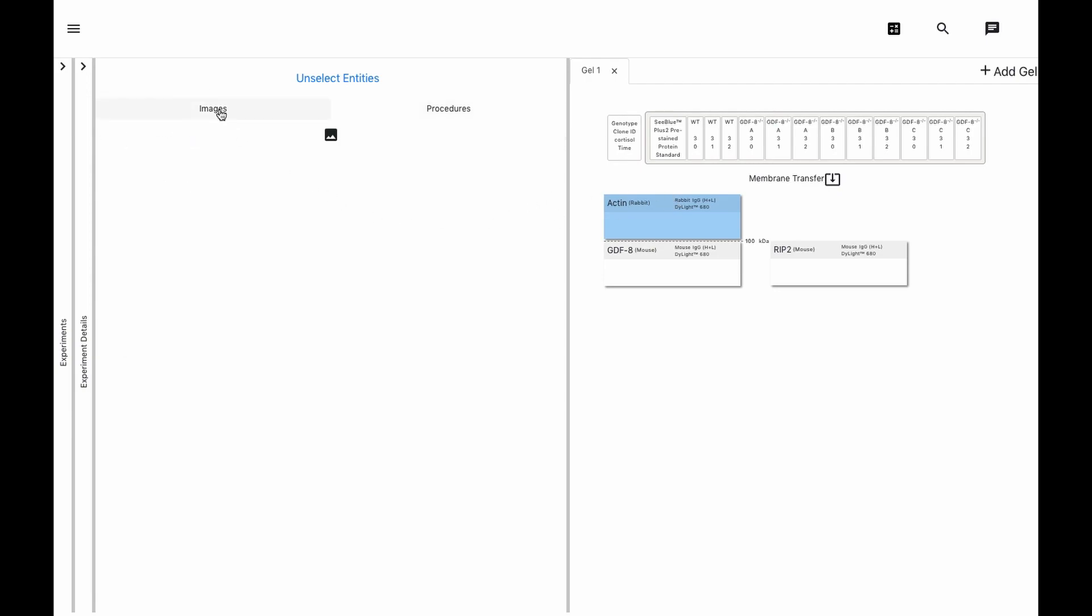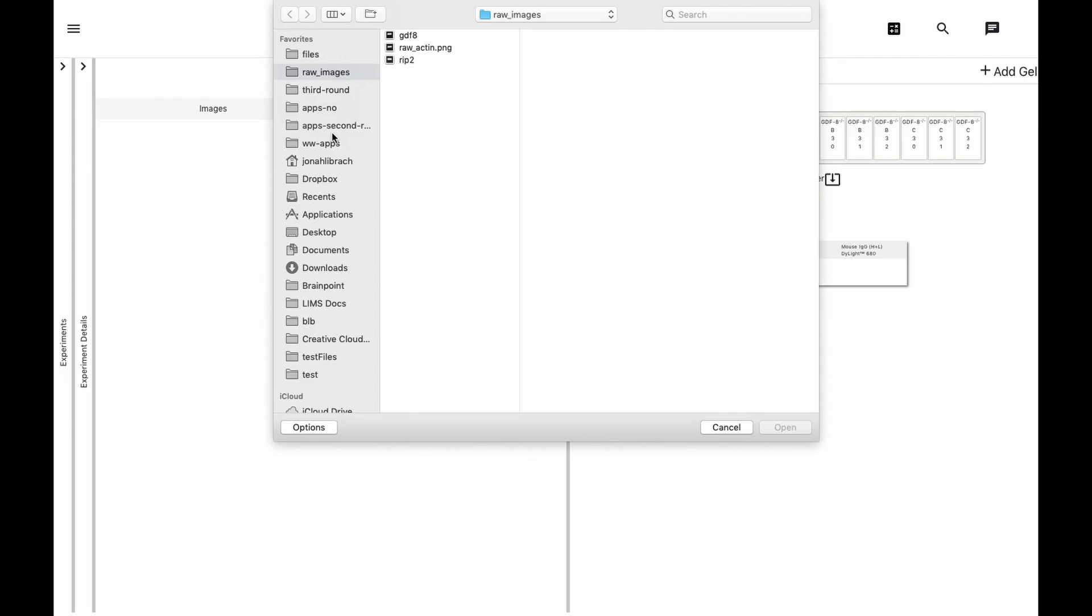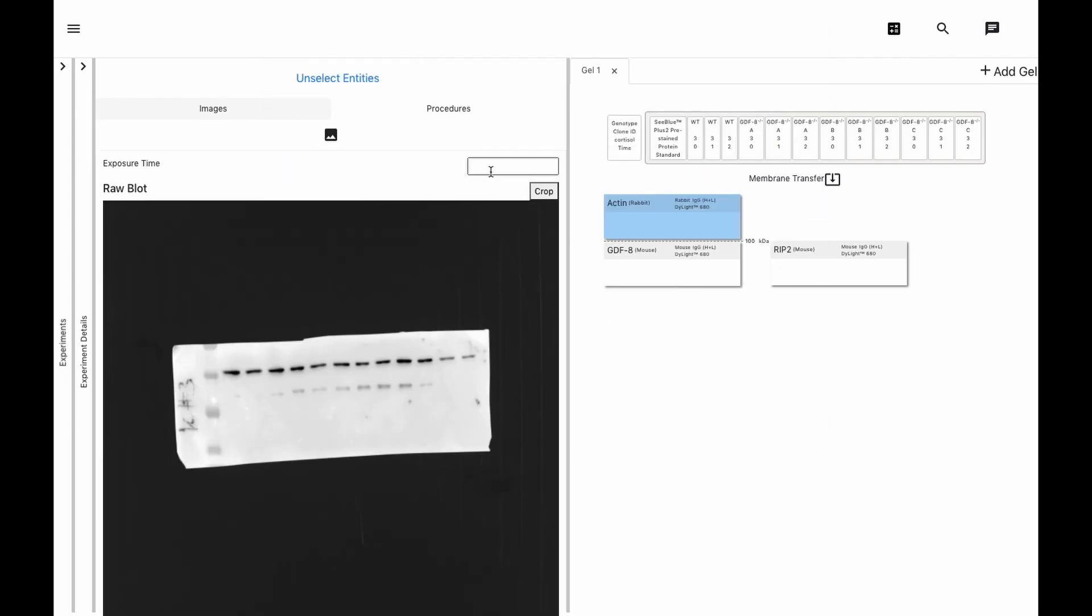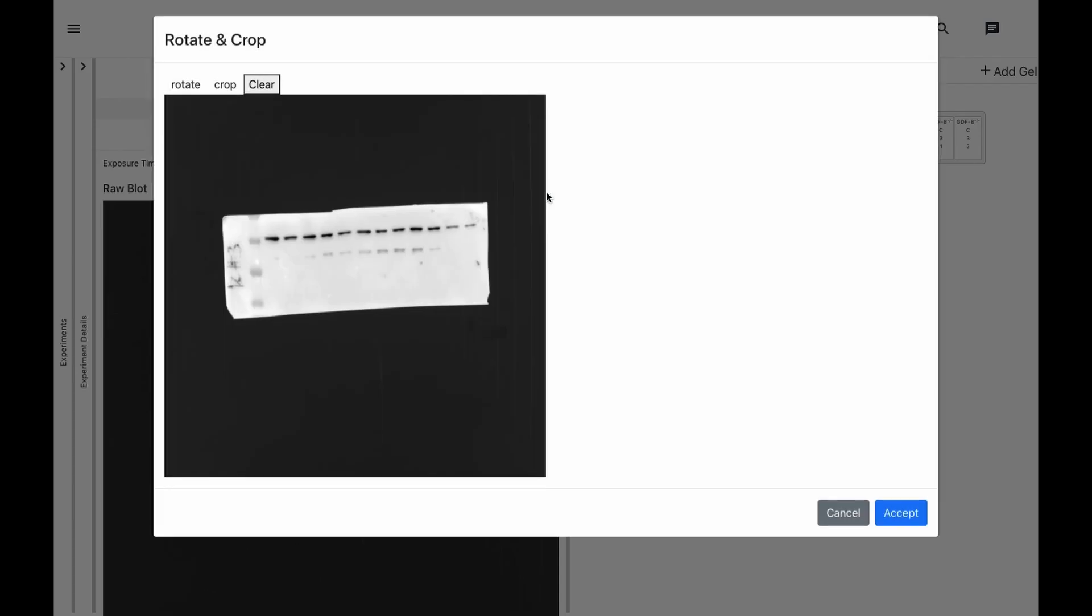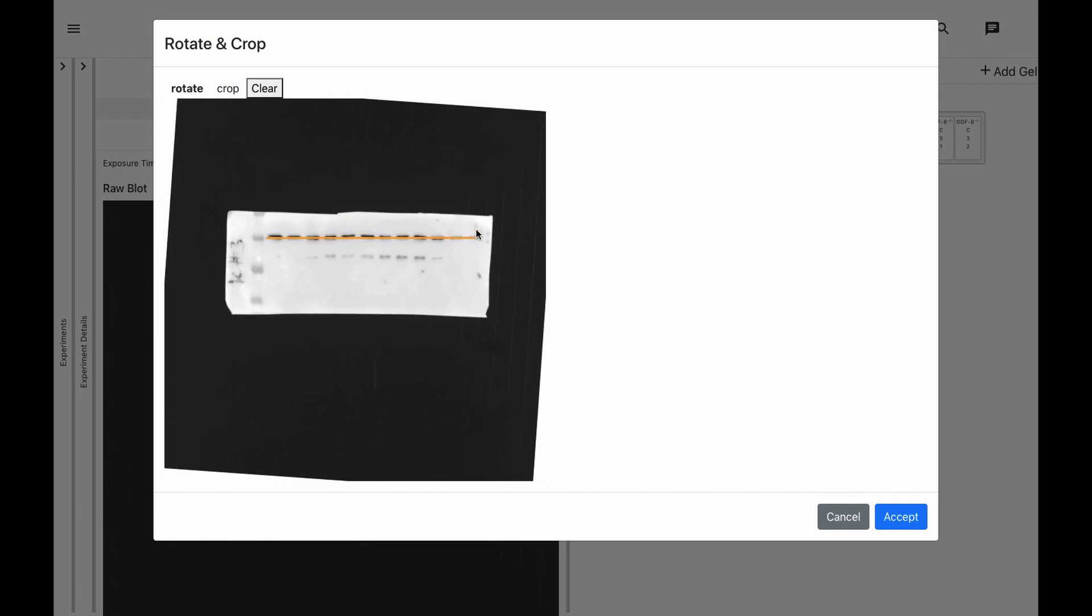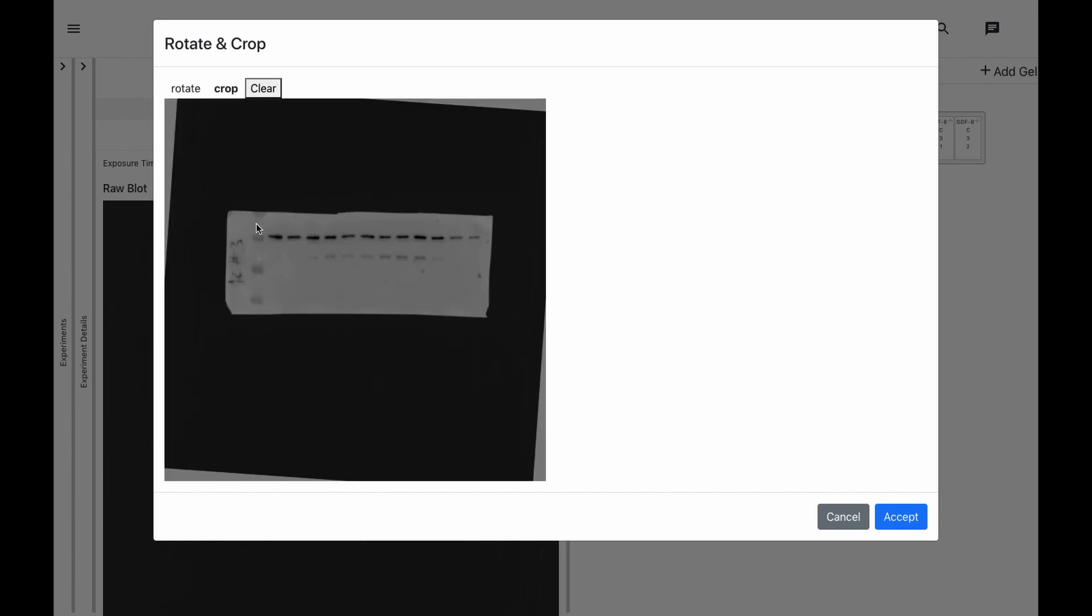Finally, we upload the data for each membrane in the images tab. We record the exposure time, and then rotate and crop to prepare for the figure.